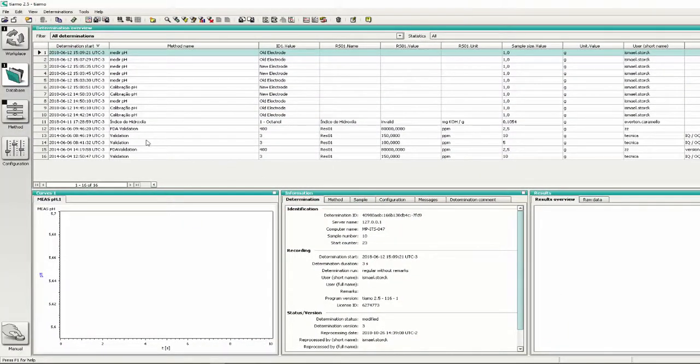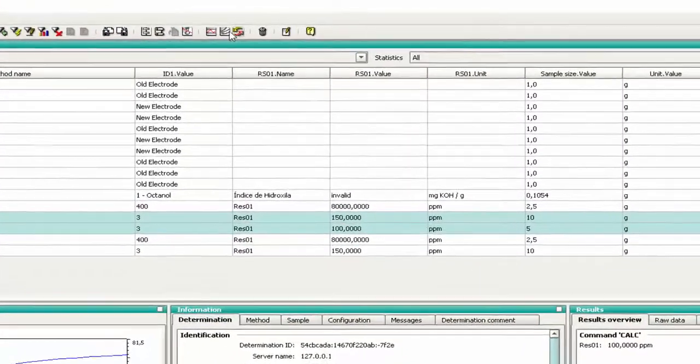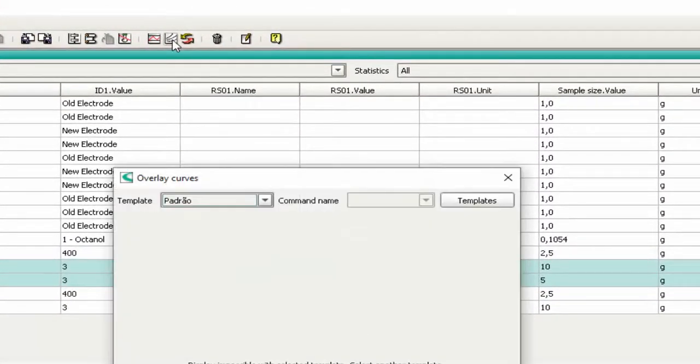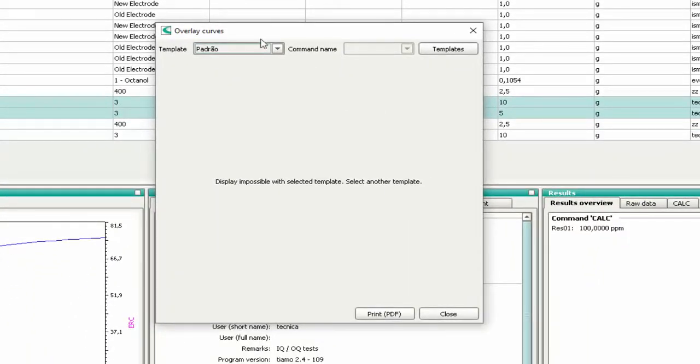To overlay titration curves, just select the samples and press the button 'Overlay curves of the selected determinations'. You will need to create a template by pressing the button Templates.